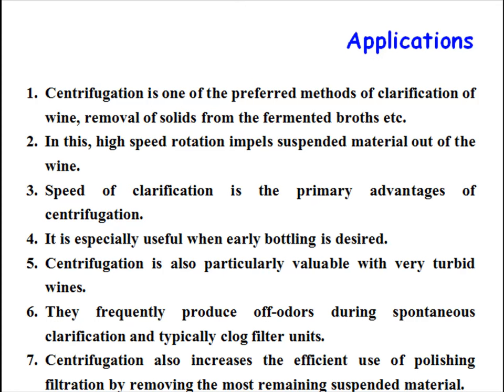Applications. There are a number of applications of centrifugation. Centrifugation is one of the preferred methods of clarification of wine, removal of solids from the fermented broths, etc. In this, high-speed rotation impulses suspended material out of the wine. Speed of clarification is the primary advantage of centrifugation. It is especially useful when early bottling is desired.